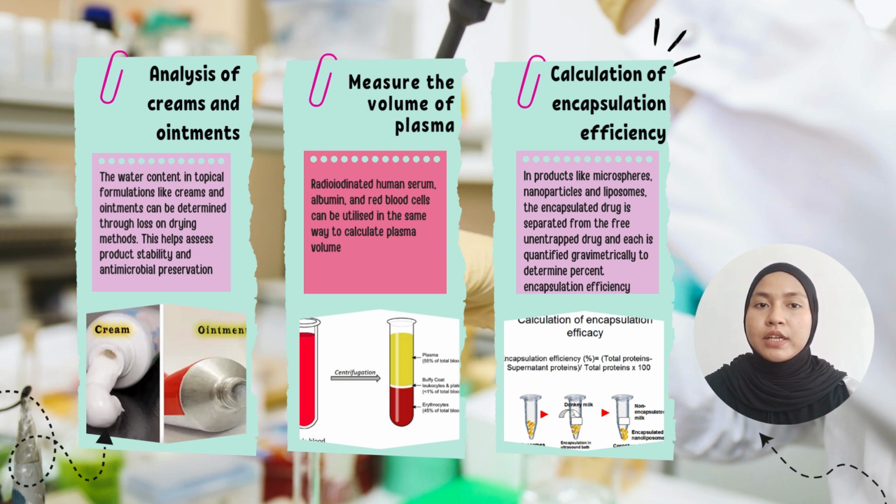Lastly, calculation of encapsulation efficiency. In products like microspheres, nanoparticles, and liposomes, the encapsulated drug is separated from the free and untrapped drug, and each is quantified gravimetrically to determine percent encapsulation efficiency.